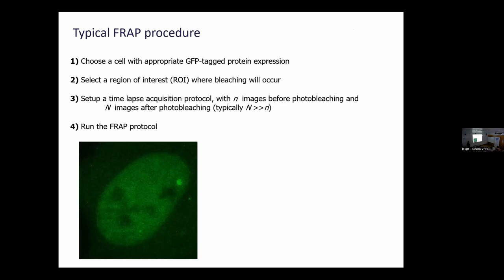Okay, let's see a FRAP experiment. So this is a cell, it's expressing a GFP tagged molecule that's binding to specific RNAs in this transcription site. This is a tandem integration of a gene, the modified beta globin gene that in the lab was added to U2OS cells.